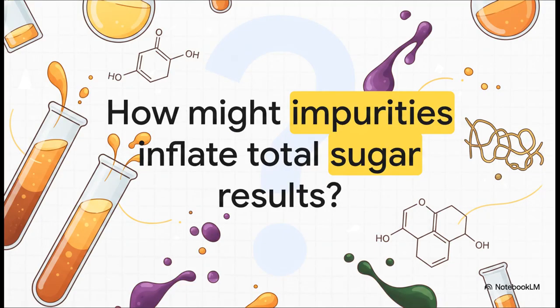Before you grab your lab coats and perform this for yourselves, I want to leave you with one absolutely critical thought. The accuracy of this entire assay completely hinges on the purity of your sample. If co-extracted molecules, like certain plant phenolics or proteins, happen to alter or darken the color of your reaction, how might that falsely inflate the total sugar results of your next complex assay? Keep that in mind as you prep those samples.